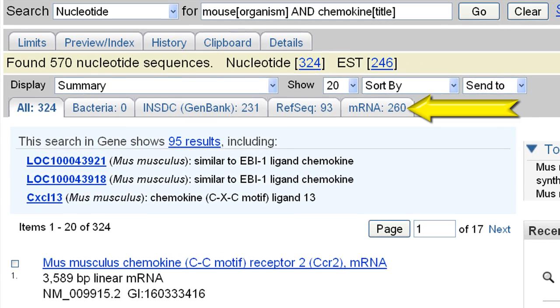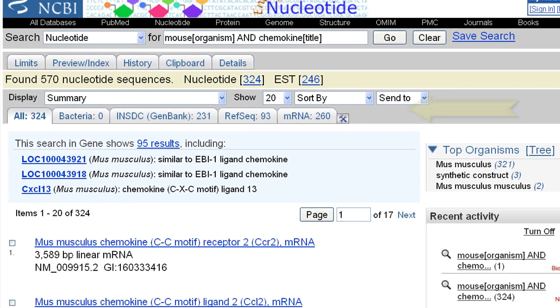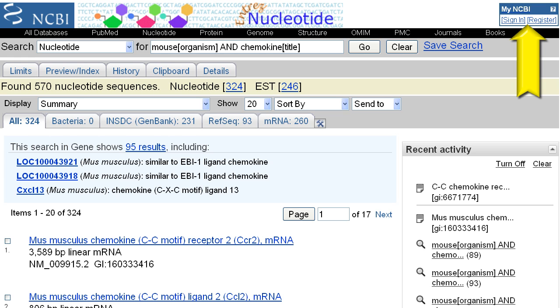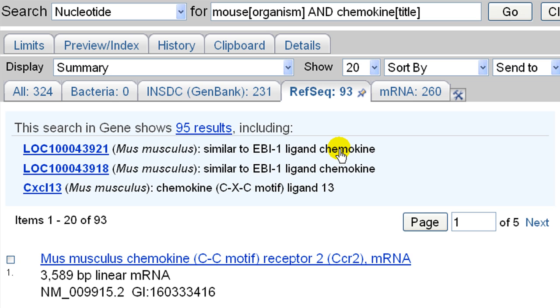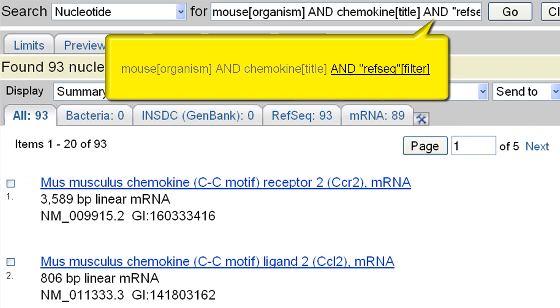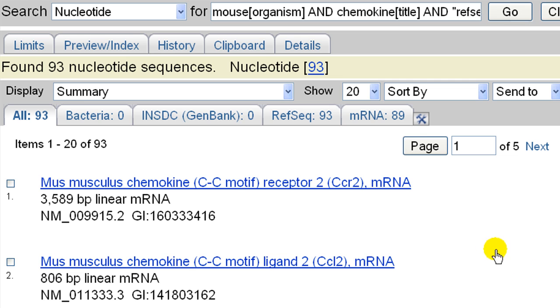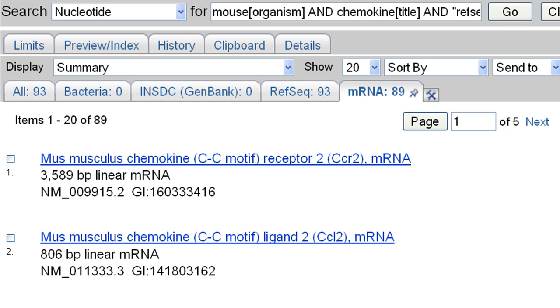The tabs represent preset filters that are applied to all searches in this database. You can set different filters by logging into your My NCBI account. I'm going to select the RefSeq or Reference Sequence tab to get a non-redundant set of sequences. Clicking the pushpin image on the tab locks in that search term — see how the search term gets added to the query. Now when I select the mRNA tab, I have the set of mouse RNAs from RefSeq with chemokine in the title. Unless I also lock in the mRNA filter, the retrieval in the next step will include any non-mRNA records, so I'll click on the pushpin.